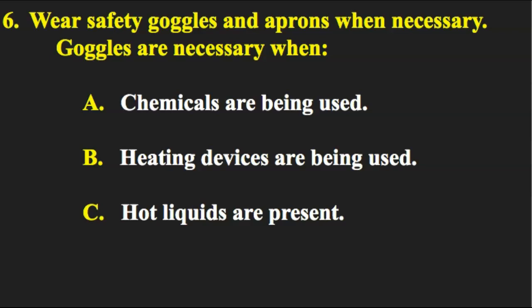Now you'll notice there's 3 things that you need to type into your presentation for your notes. Goggles are necessary when chemicals are being used. Now, technically water is a chemical, but generally if it's just regular tap water or distilled water, you won't have to wear goggles. However, there might be something mixed with that water, so you have to make sure you wear your goggles when we tell you to.